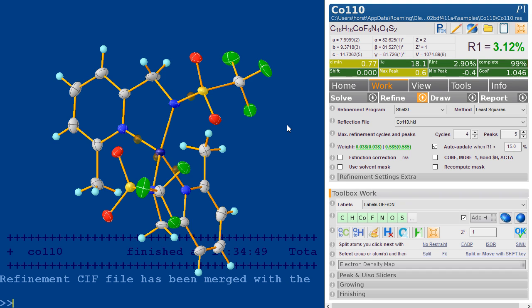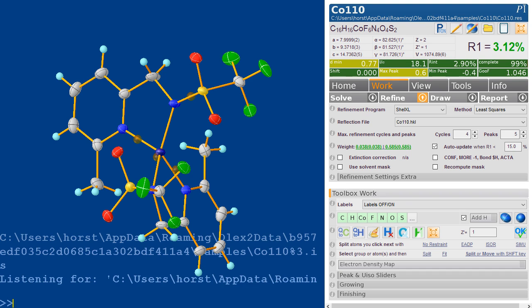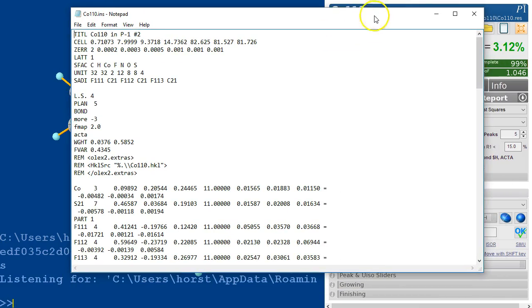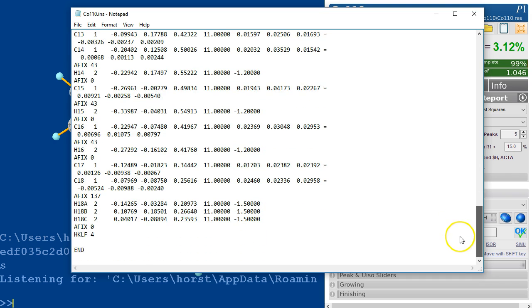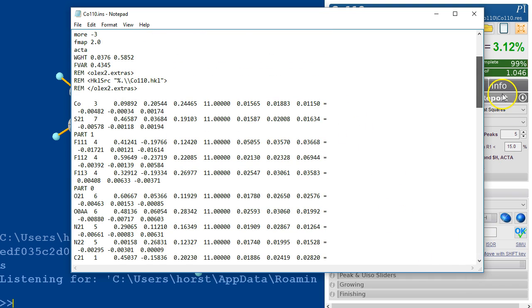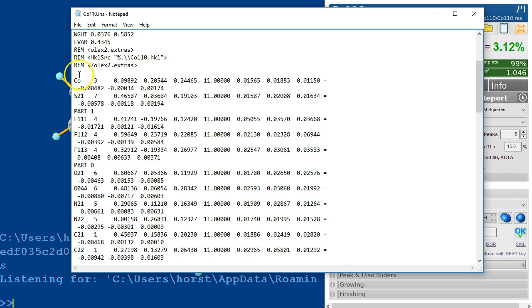If you did want to edit the file, you can type edit ins. And this does exactly what it will do when you press refine. So it creates an ins file and that's the full ShellX ins file as it will be sent to ShellXL. So now we are listening for this file. Any changes you make in this file will be taken over by Olex 2. But again, I really don't see the need to do this.